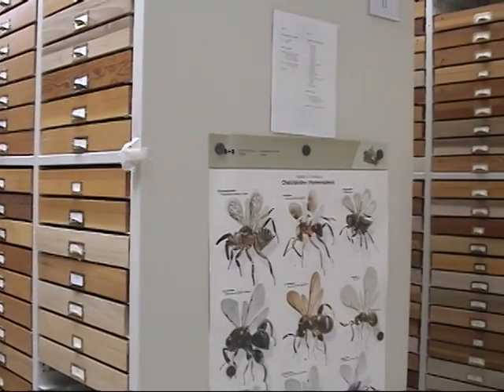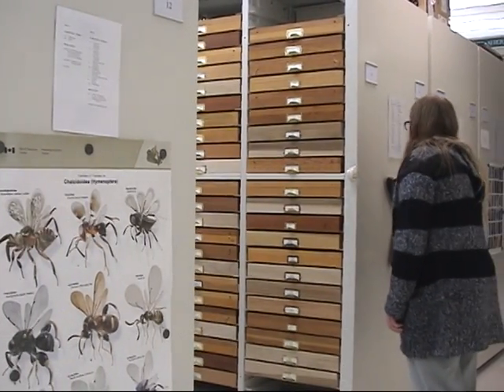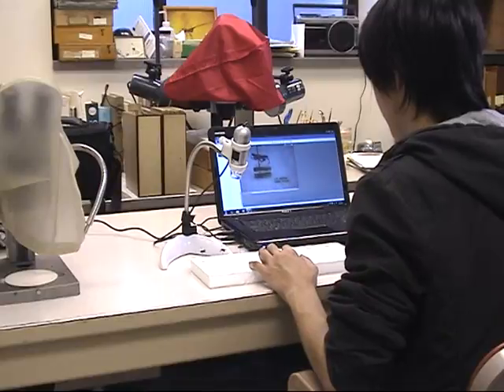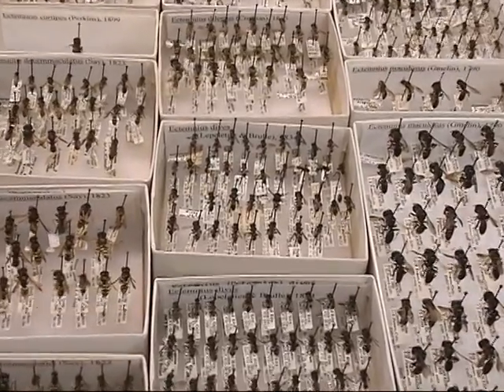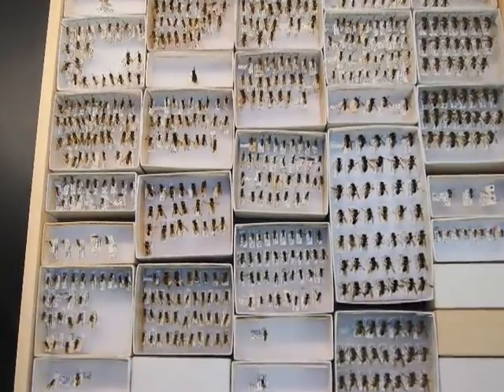Entomology collections encounter several unique challenges that prevent efficient capture of specimen data. The first difficulty stems from the vast number of specimens. There are millions of specimens housed in museums throughout California, and digitizing each specimen is a monumental task.